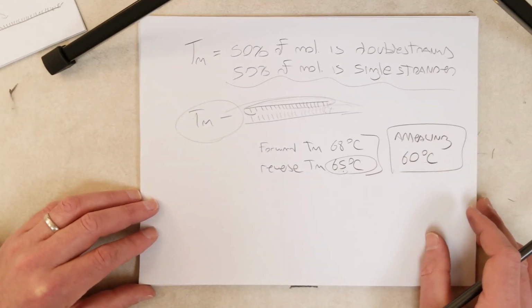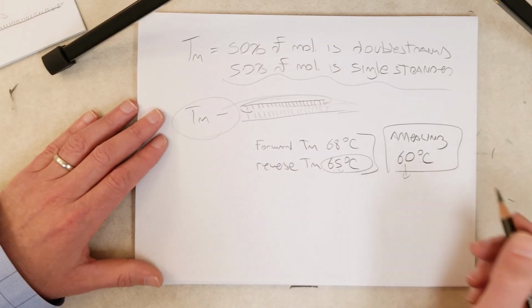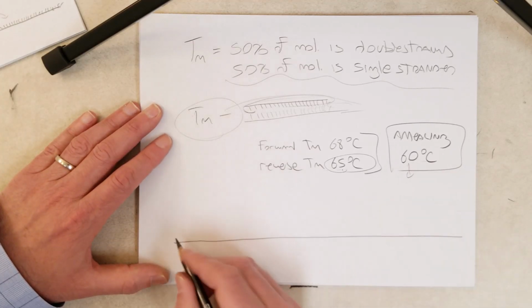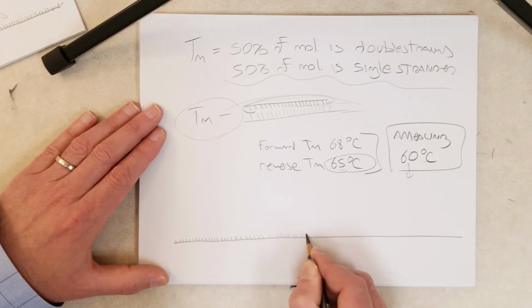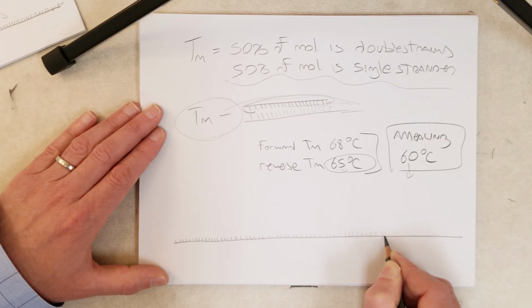And why is this important? Why not just choose 30 degrees, like a really low annealing temperature? And maybe I can explain that with this diagram here. So let's assume this is a long piece of DNA that we're trying to amplify by PCR, we're trying to copy by PCR.